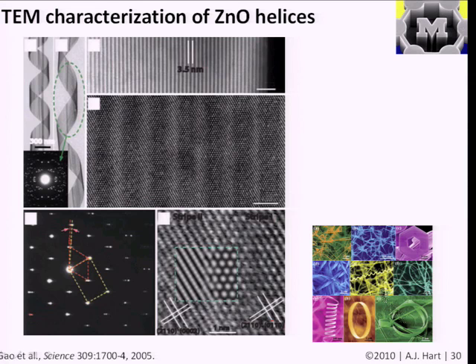And to connect to the example of zinc oxide that we showed last time, this is just some excellent characterization of the structure of these helical belts from Z.L. Wang's group at Georgia Tech. And here they were using TEM at high resolution, at the resolution that will resolve the lattice, to show that these belts consisted of different domains having different crystal structures. So I don't recall what crystal structures these are, but you see this striping from one domain to the other, and you can actually resolve the atomic interface, and you can see that the orientation of the lattice is different, and they suggest that in the synthesis process, whatever drives that change or the formation of that domain boundary is what then causes the twist, because these bands then stack up into having, you could say, a sub-micron scale twist resulting from this atomic interface behavior.